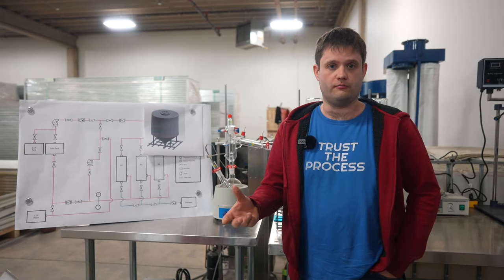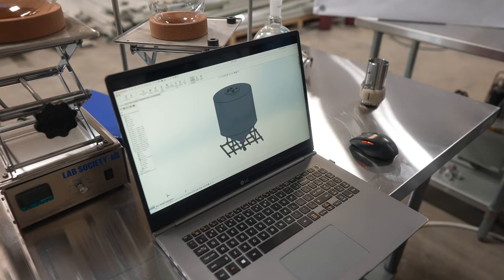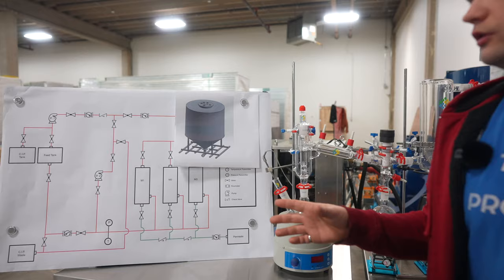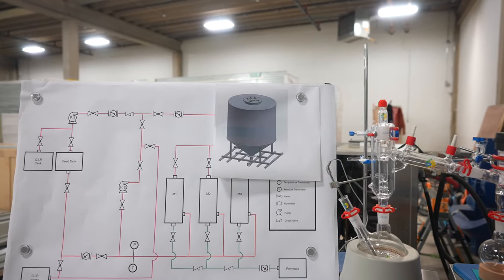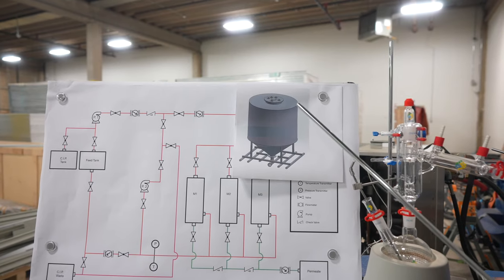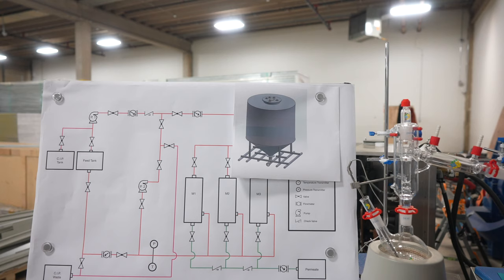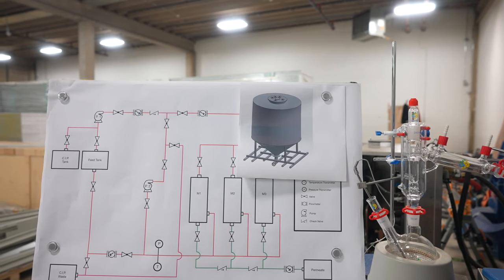The way our process is going to work is our dried and milled biomass will get put into batch reactors — batch tanks. These are going to be approximately 3,000 liters apiece, and each one will hold 20 to 30 minutes worth of biomass. You can see on the lid that we've got inlet ports for our solvent, for our nitrogen, for our inerting system, for worker and process safety, and for the various other sensor connections that we're going to have on these tanks.